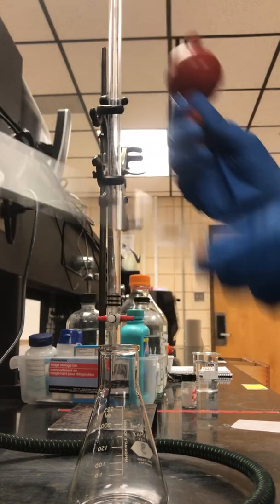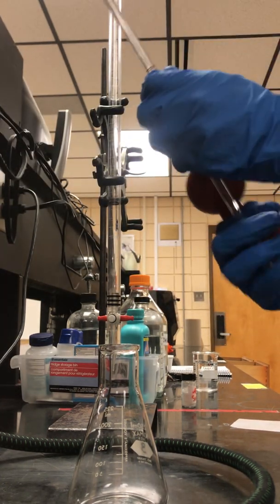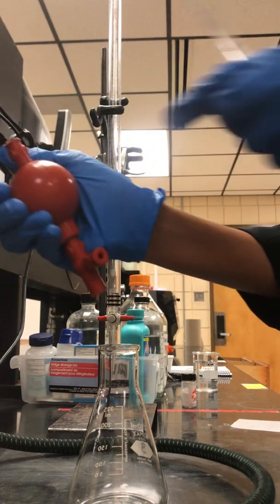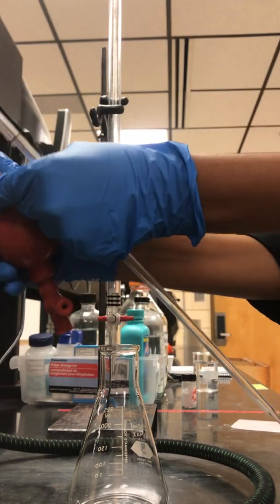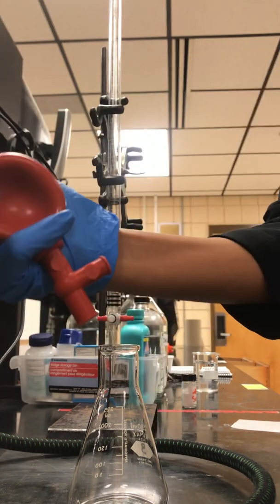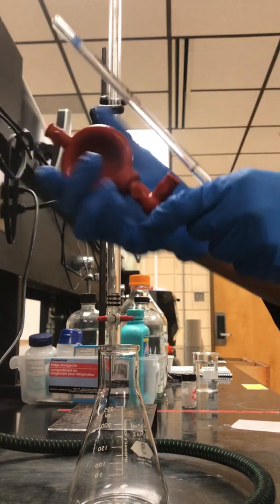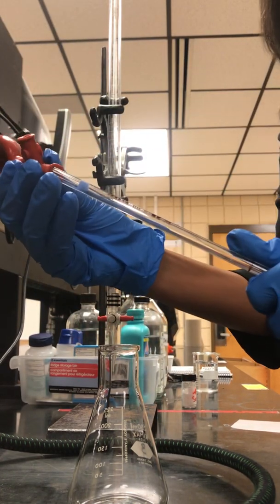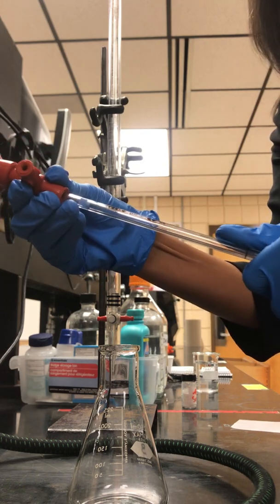Then the directions tell you to pipette 25 milliliters of hydrochloric acid, HCl. You're taking your pipette bulb and pipette. Press the A, squeeze it, then squeeze the bulb so the air can come out. Place the bulb on top of the pipette.